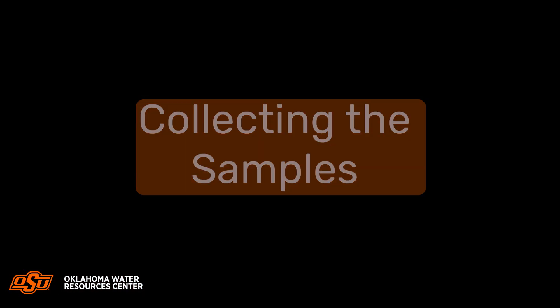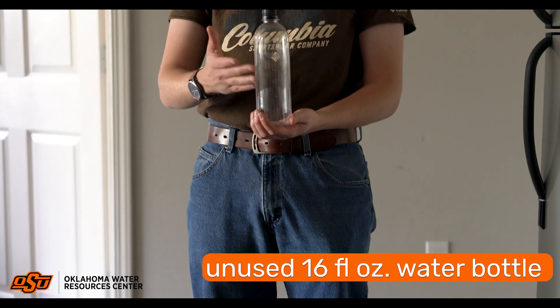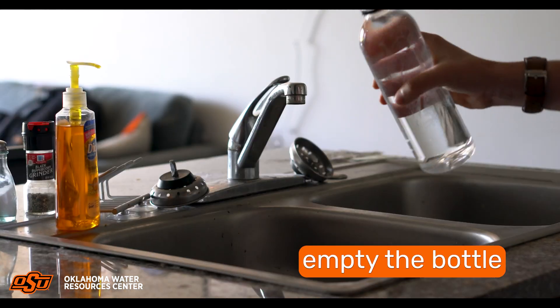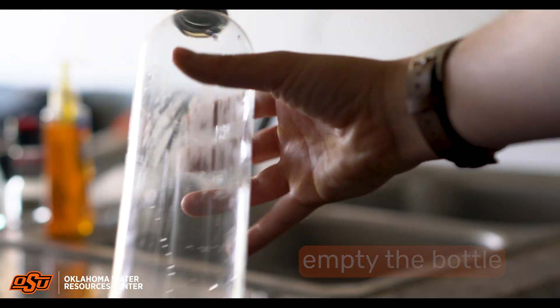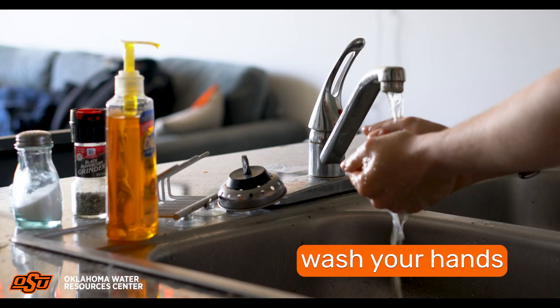Here's how to collect your sample. You will need a new and unused 16 fluid ounce water bottle. Any standard size plastic water bottle that can be found at your local grocery store will work to collect your sample. Simply empty the water bottle and drain all its contents to reduce cross-contamination of your sample. Once the water bottle is empty, please wash your hands before collecting your sample.